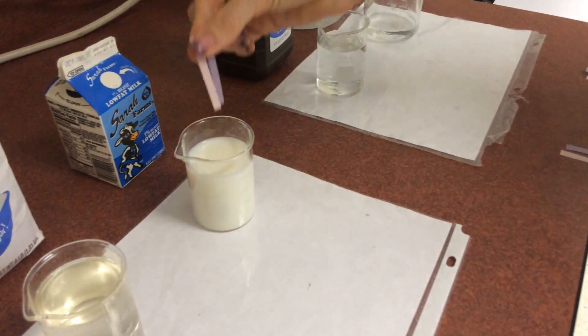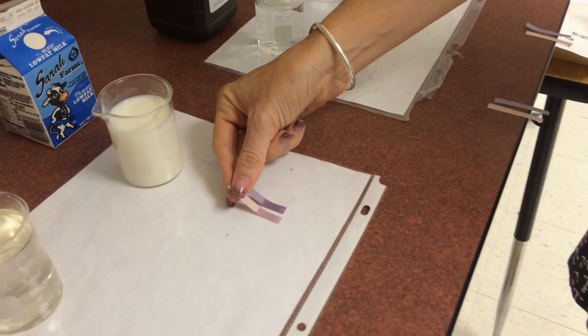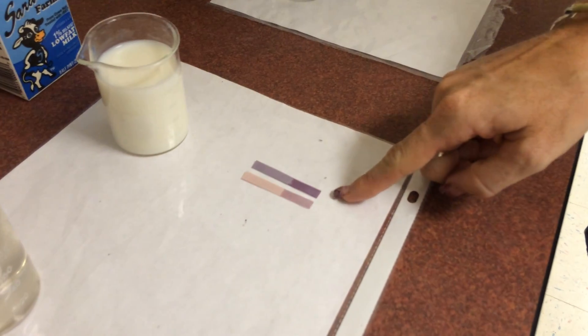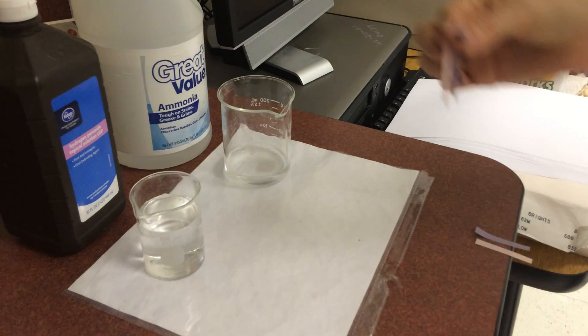Milk does the body good. Ooh, it's like magic - you can't even see what's going on. So we got slightly blue and definitely blue. So milk is just barely a base.